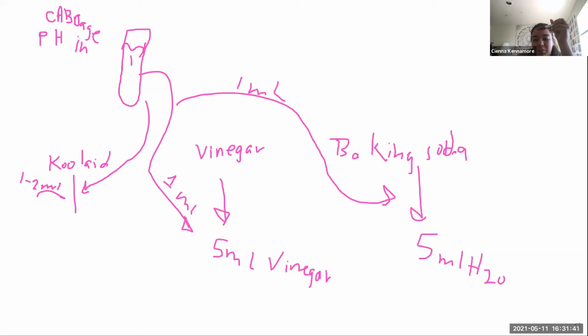Do I have to indicate the pH of this? I'm confused. What is the color that it starts off with? That's a good question. I want to say it could be red or a very deep purple, somewhere in the 1 and 2 area. So record what you have, which is weird, because that means your water is very acidic. That doesn't make sense if it's distilled.